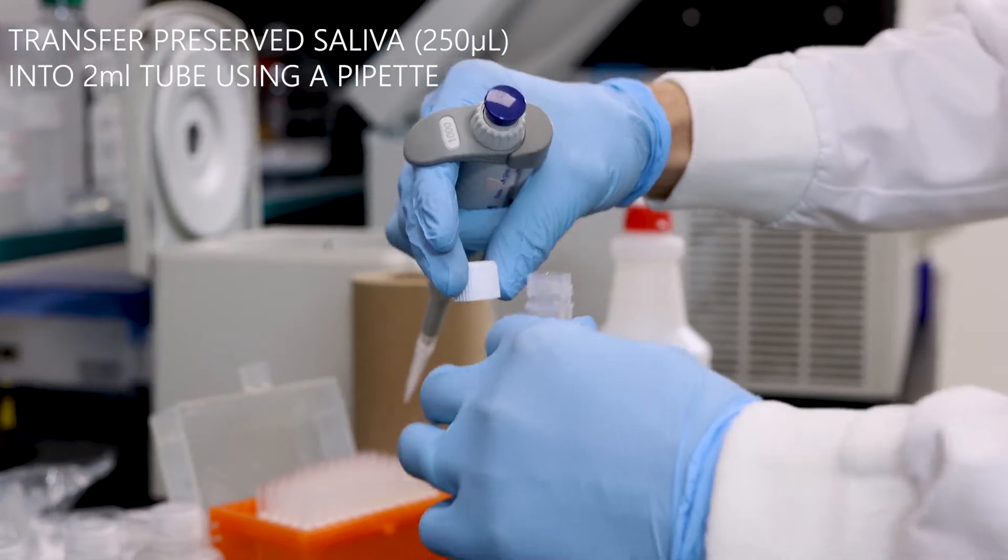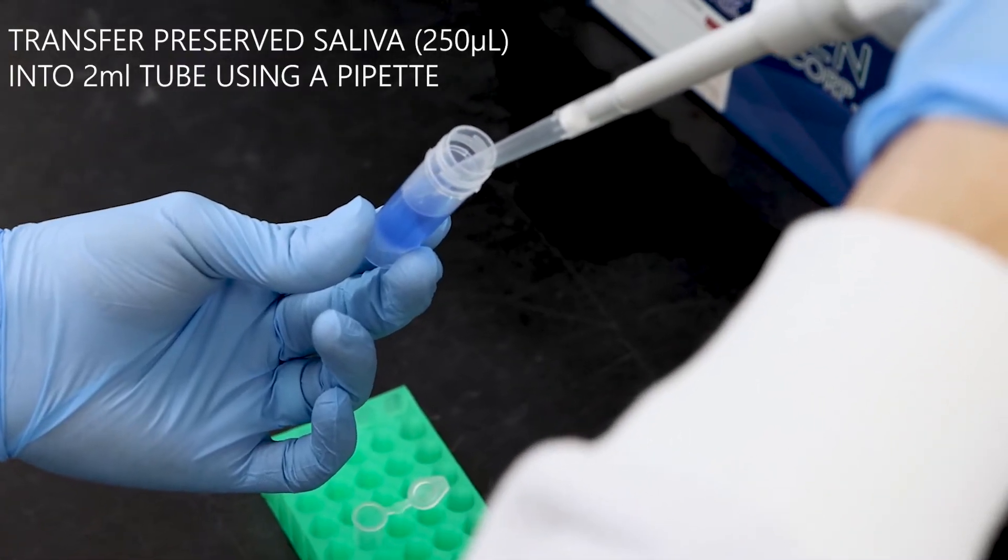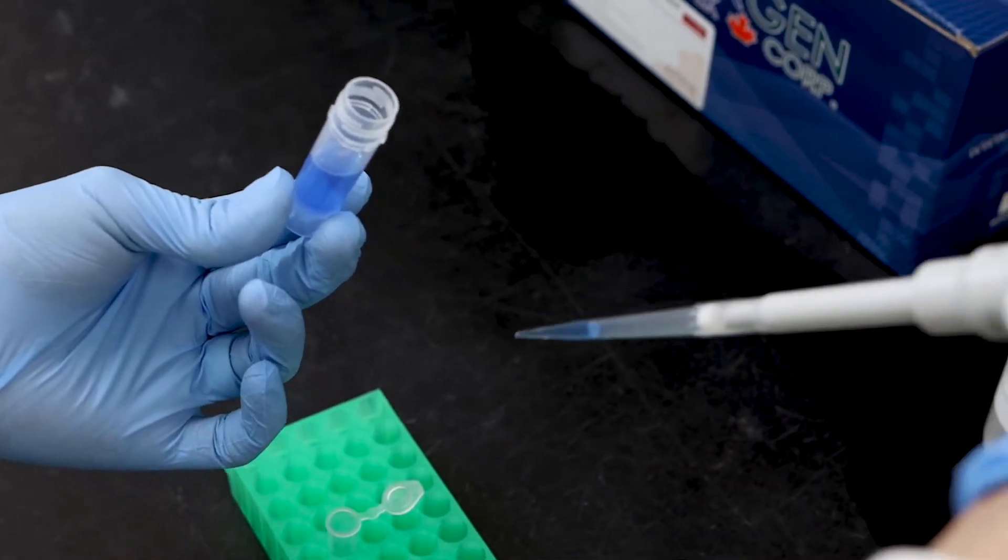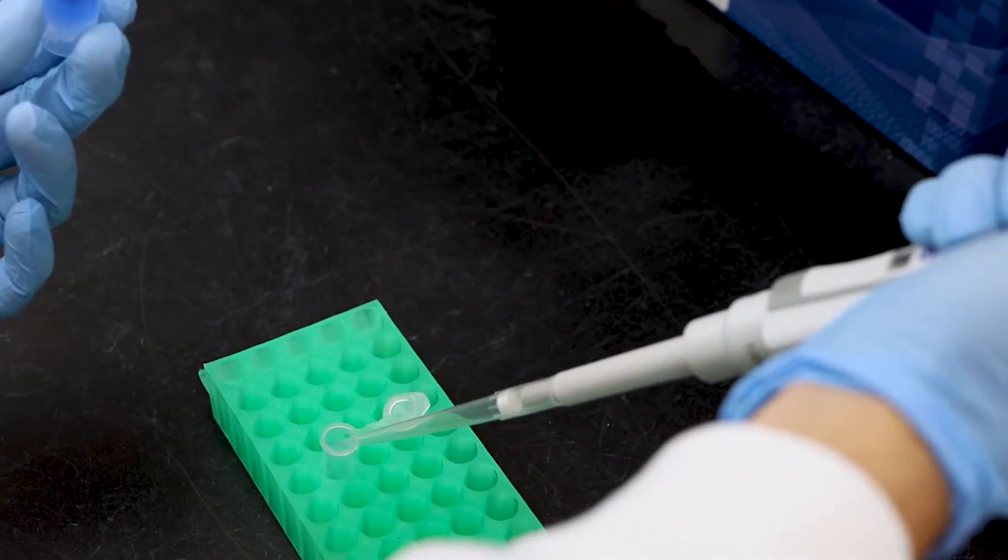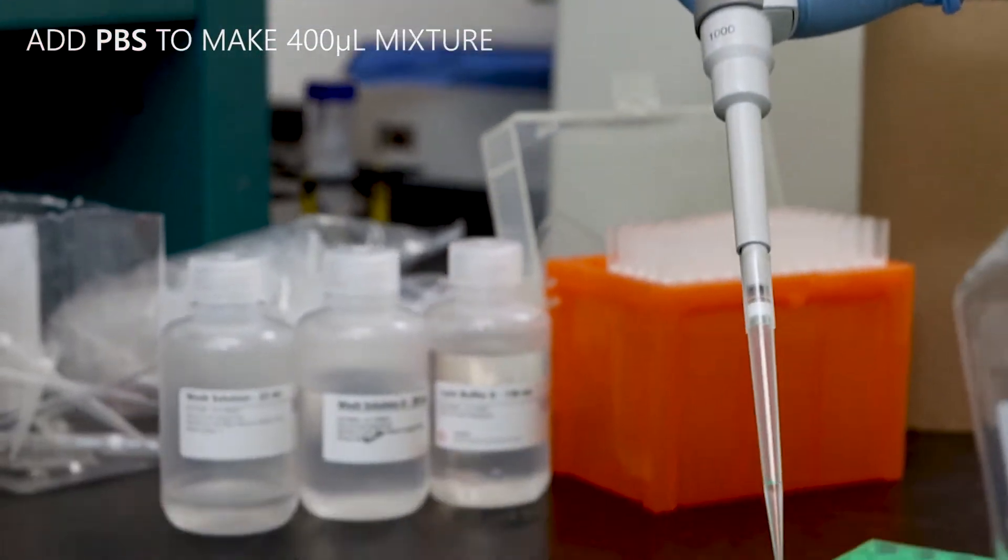Transfer 250 microliters of preserved saliva into a 2ml tube using a pipette. Add PBS until the volume of the mixture is 400 microliters.